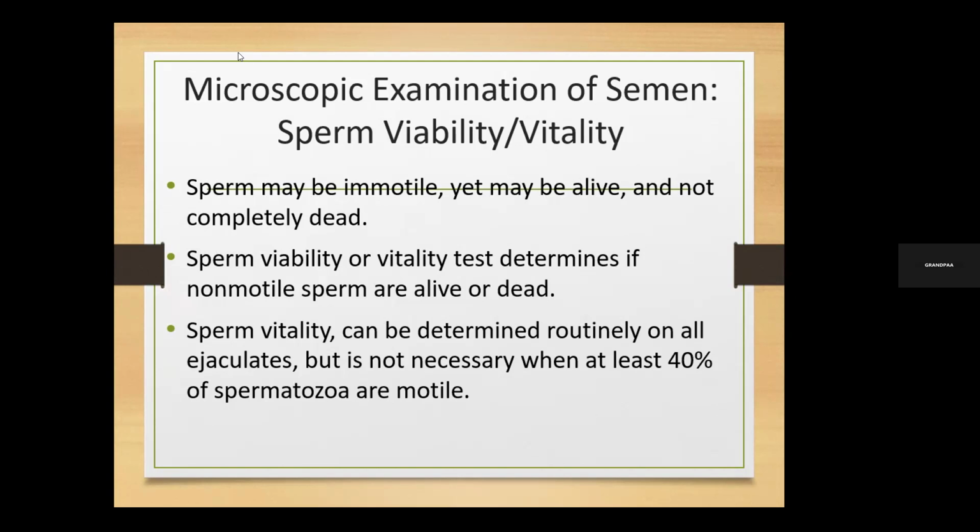Sorry for that interruption. So you said that once your sperm motility is showing high numbers of immotility, you have to do the viability test. Viability is also called vitality. So vital is about life. When you're talking about vitality, you're talking about those that have life. So viability and vitality can be used interchangeably. When you say viability test, it's the same thing as vitality test. Whichever way you go, it is the same.